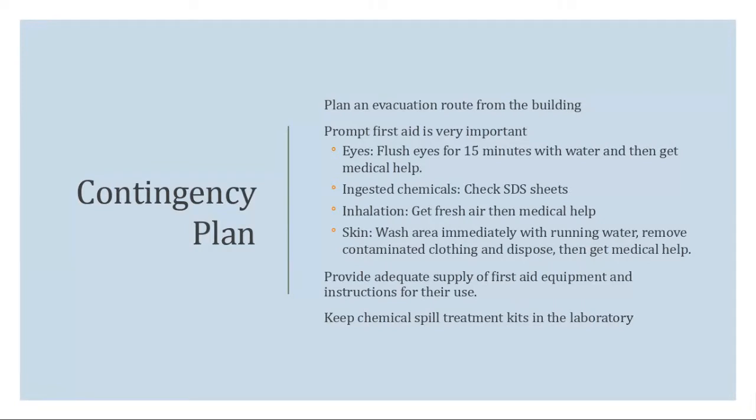If something like that happens, there's no other route. You'll just strip down what you can, get all the stuff off, just to save you health-wise, and then we'll get medical help from there. We do have adequate supply of first aid equipment and instructions for use in the laboratory, and we do have spill kits.